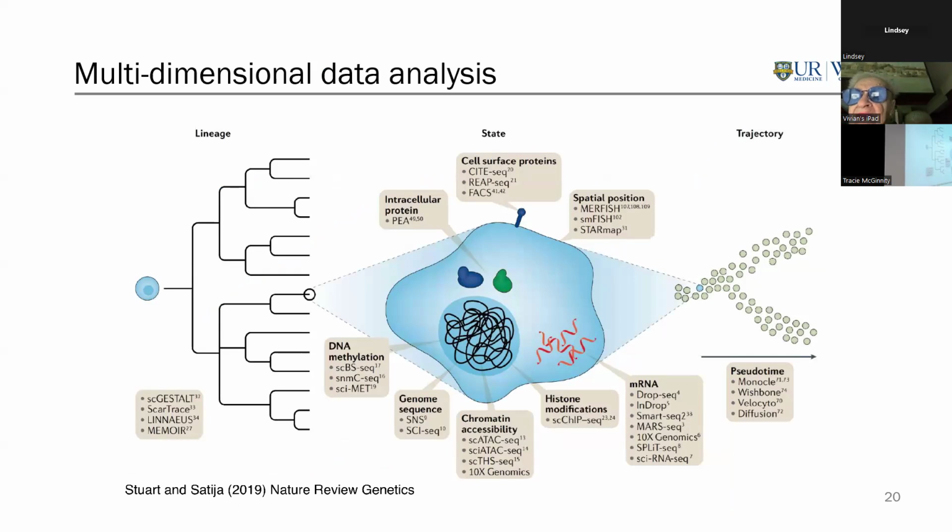It actually is right now, where you will have to do multiple things, multiple omic technologies, whether it's RNA-seq, single cell, spatial, or even just epigenetics. You're going to do ATAC-seq to look at chromatin accessibility. But then you're going to do RNA-seq to say, well, does that make sense? Do I have transcripts that are being made or not, based on what my prediction is? All of these require data integration.